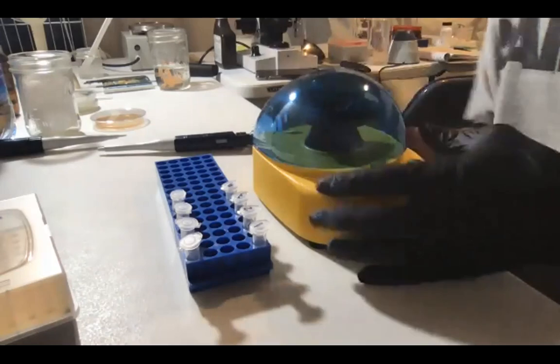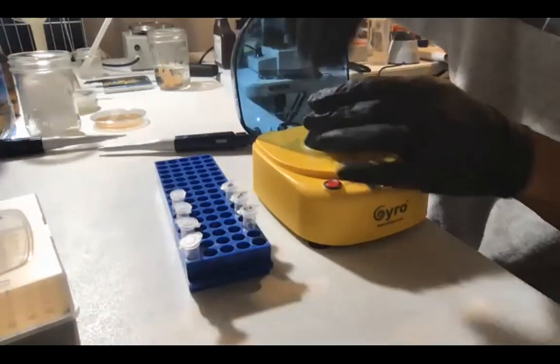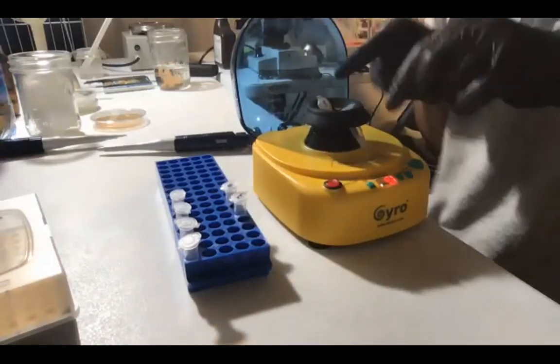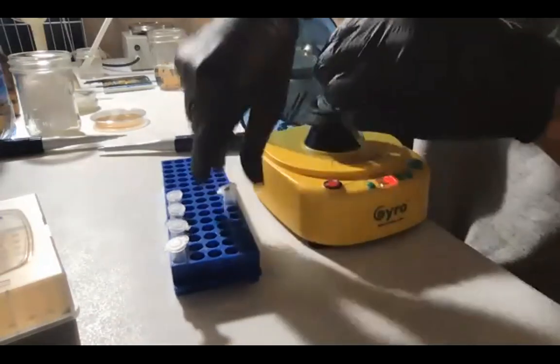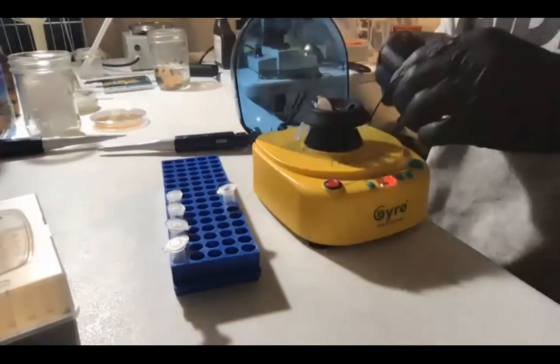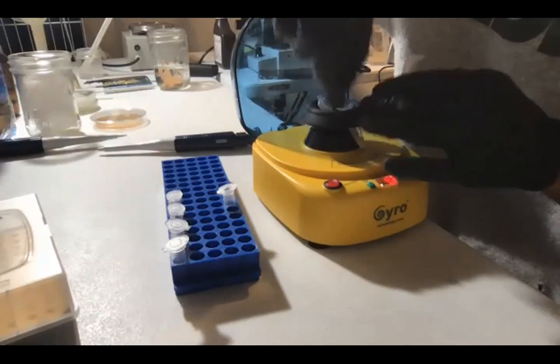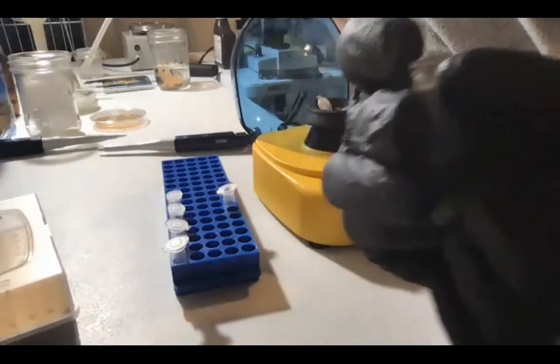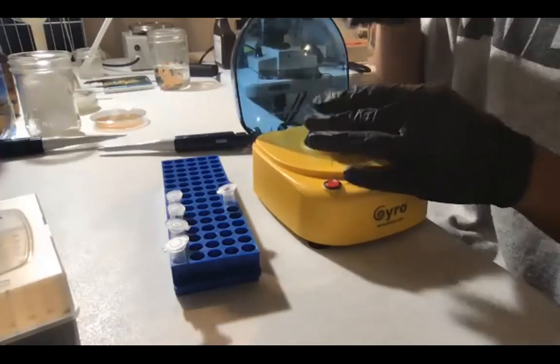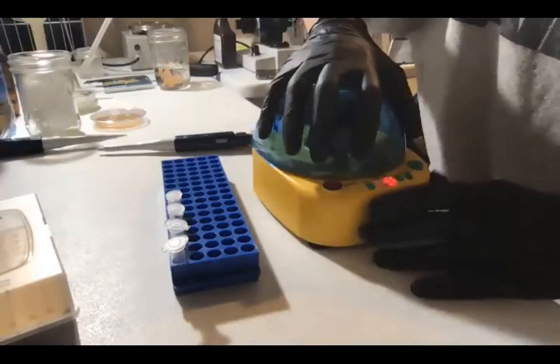And open up your centrifuge, turn it on, and put these in here. Make sure they're opposite of each other. It just keeps your centrifuge balanced. If I was only going to run two, I don't want them to be right next to each other, because one side will be a little heavier. So just make sure that they're on opposite sides of each other, and make sure that the little hinge is facing outward. And close it up.